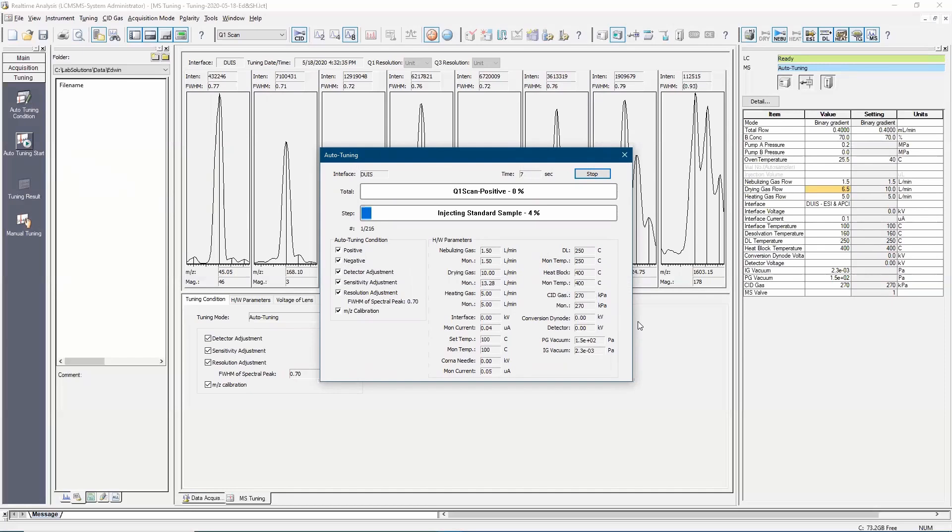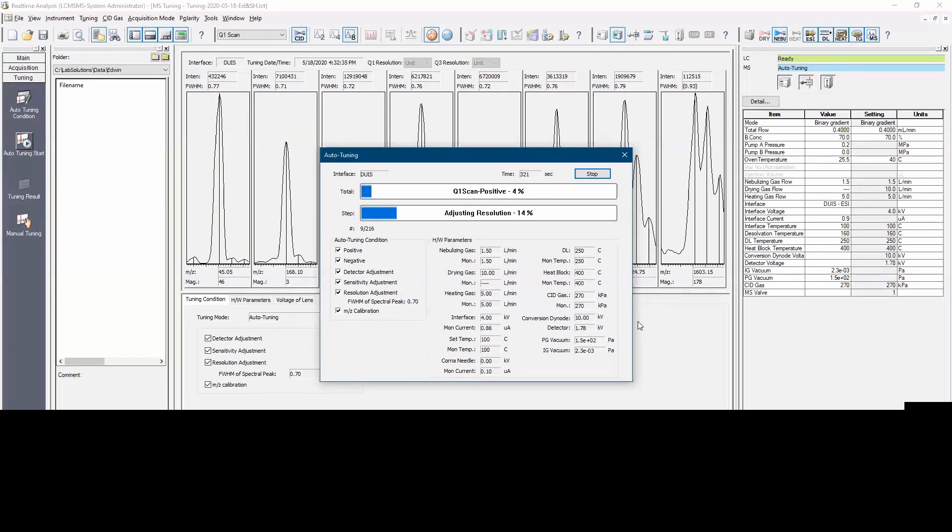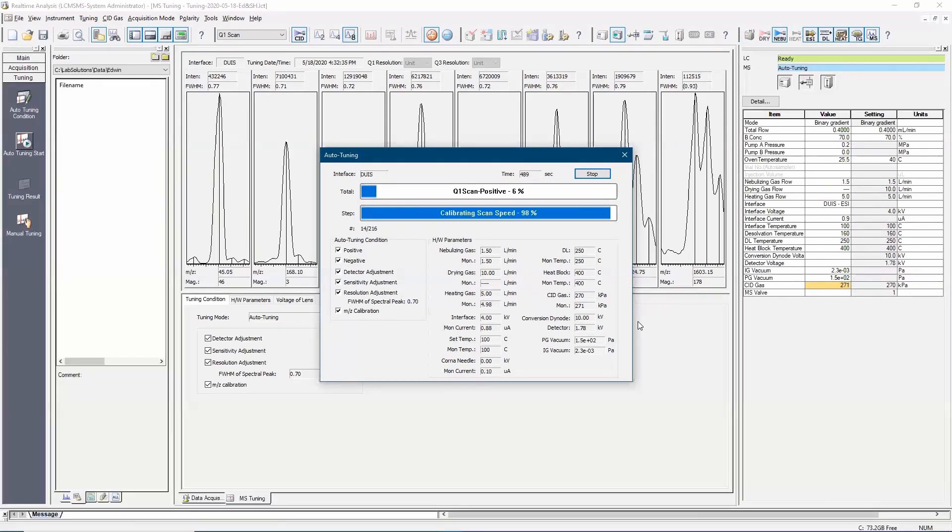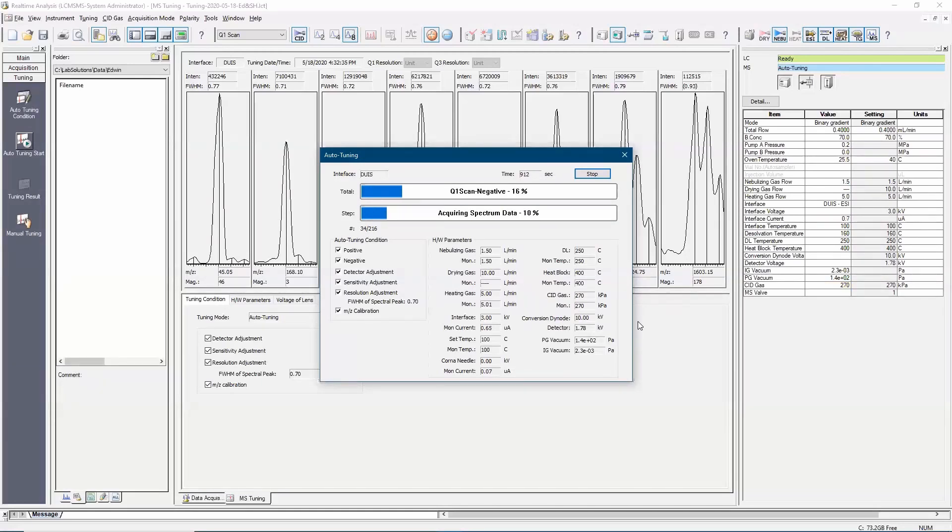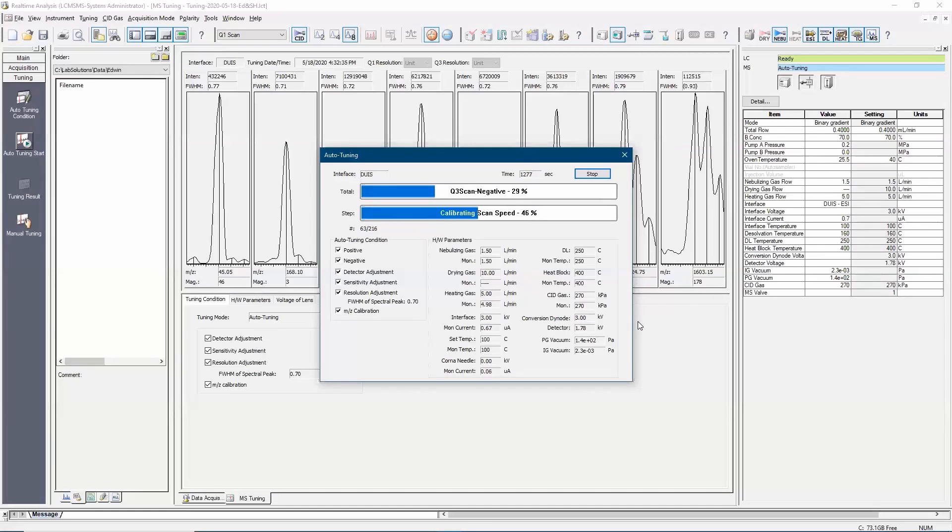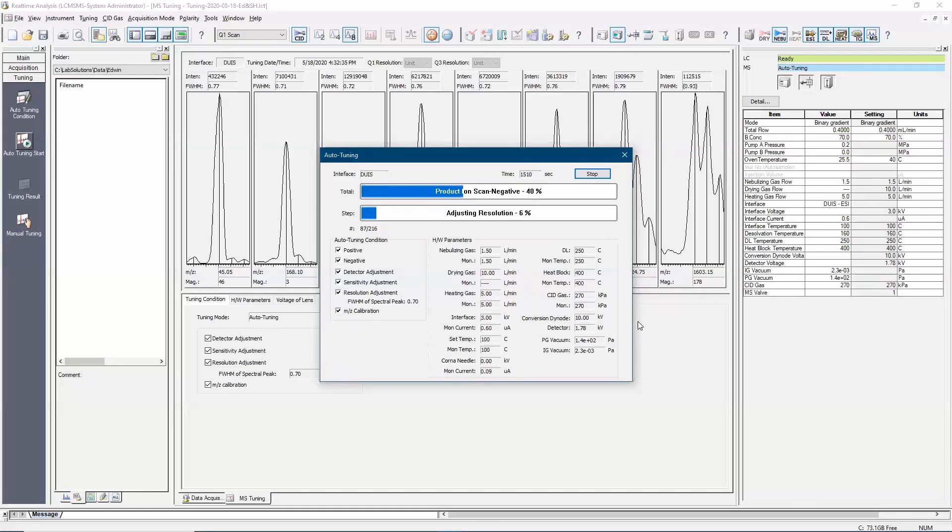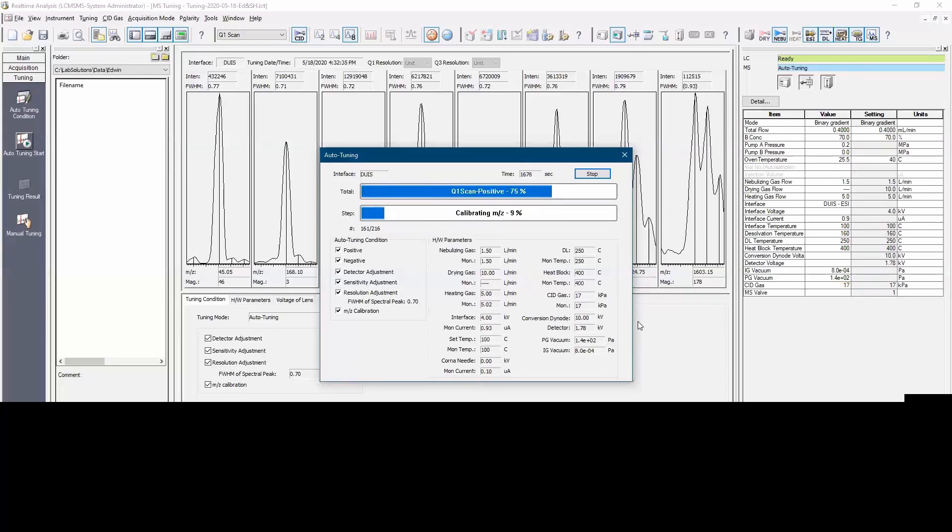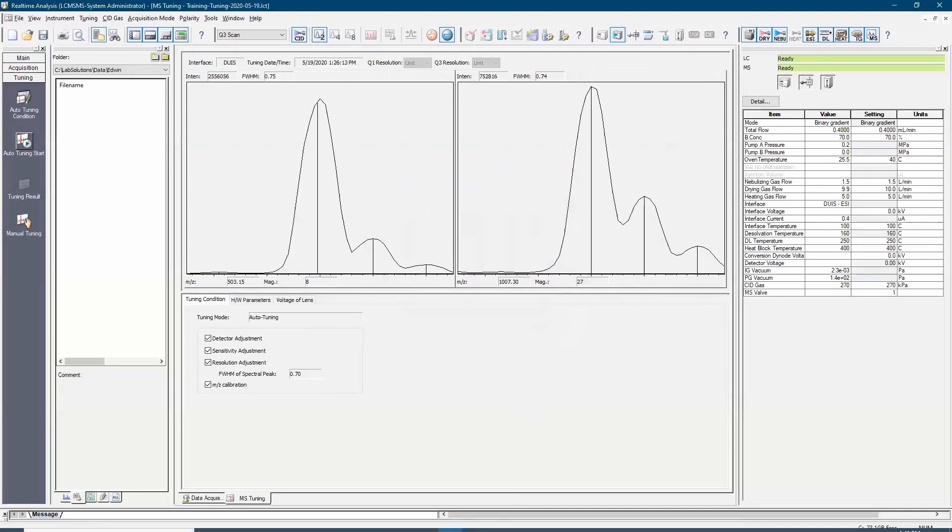It includes tuning for Q1 positive scan, Q1 negative scan, Q3 positive scan, Q3 negative scan, product ion positive and negative scan. After the tuning is done, open the tuning result file and check whether the results meet the passing criteria.